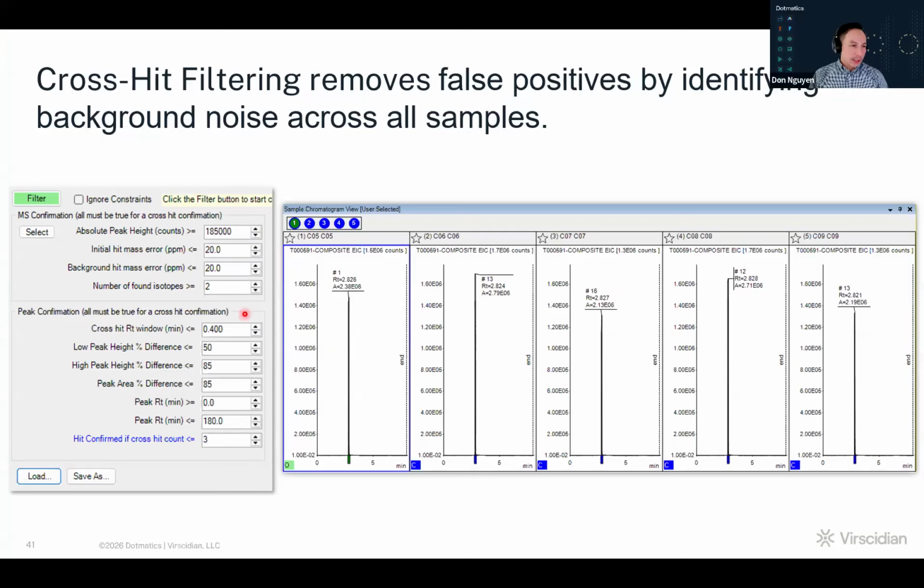It's a little bit hard to make broad strokes because every sample is a little bit different. Every protein, every buffer is a little bit different. Instrumentation is also different. So I can't just say use these settings, it's good for absolutely everything. You need a little bit of fine tuning for your particular instrument and your lab. But once you start seeing enough data, you'll get a good idea of what settings can be used to define exactly for your situation what is a background signal or what is noise.